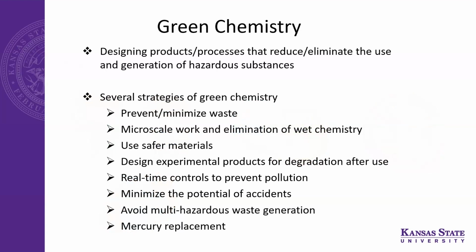So when they enter the lab, all their food should be in their backpack. Everything should be in their backpack. Nothing visible, nothing on the lab benches or lab tables. And of course, if they need to drink or have a snack, they are welcome to go outside the lab, eat, drink, and come back. But nothing inside the lab, for safety.